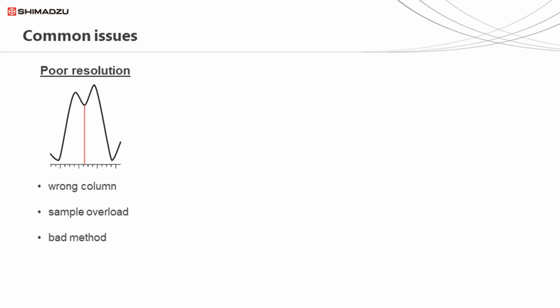Peaks that are not adequately separated is the single most common issue when operating a GC. In order to accurately identify and quantitate a peak, it must have baseline separation. This issue is not a mechanical one, and the GC is likely working perfectly well. Peak resolution is a product of the column and the applied method. To achieve suitable resolution, the analyst could try running the method for longer at a lower temperature, giving the peaks more time to separate out.